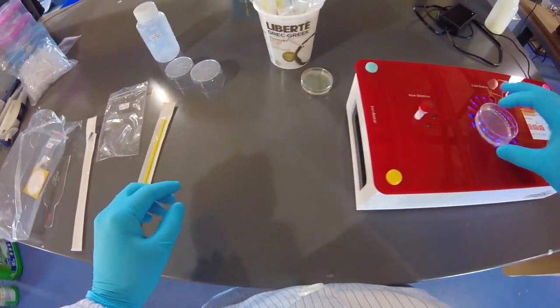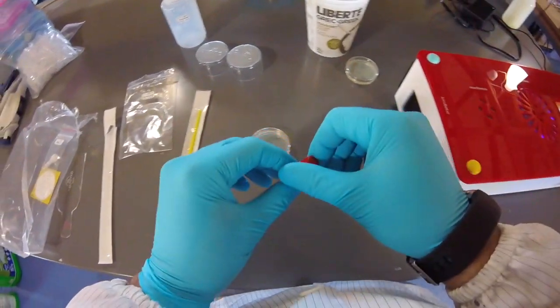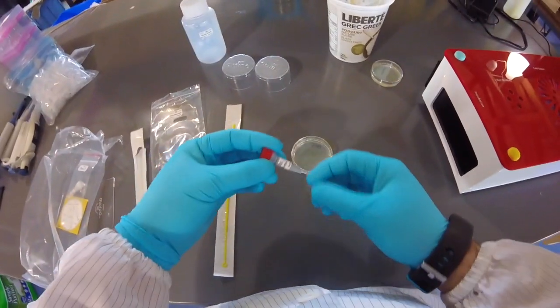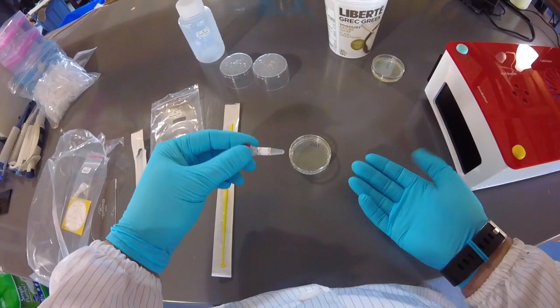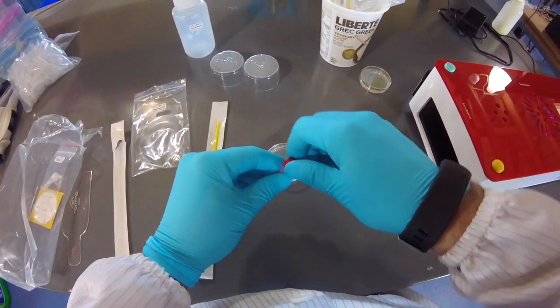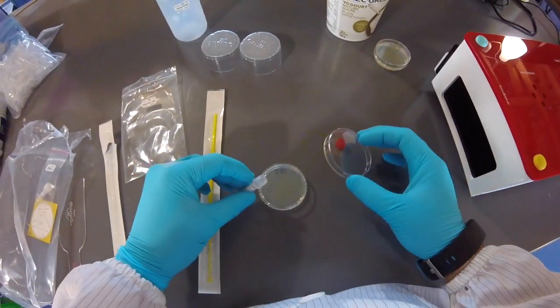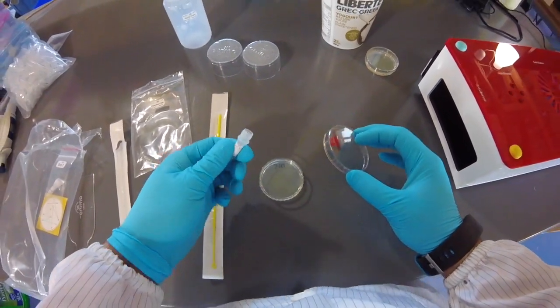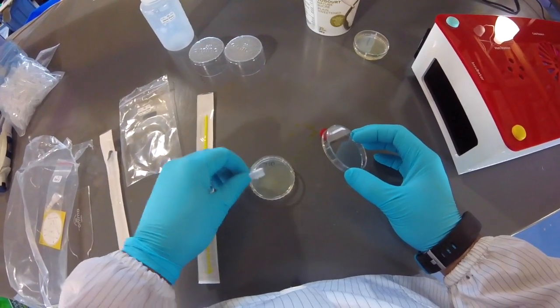And now we're on to the last part. This is the grand finale. This is what you've worked hard to get to. So again, we want about half of the cells within the tube. If you are using pipettes, 150 microliters is a good amount to put on the Petri dish. Even 100 is fine, but roughly half. So we're just going to give it a little... There we go. Just a drop like that is good. That might be a little bit less than half even. I'll give a little bit more here.